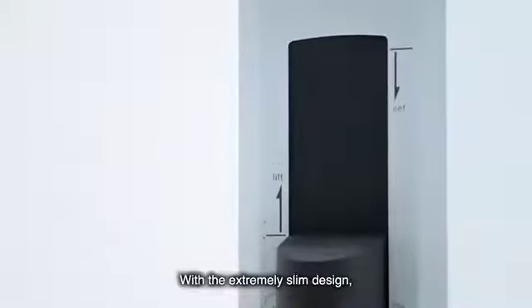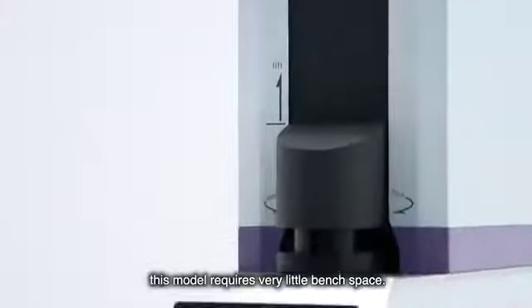With the extremely slim design, this model requires very little bench space.